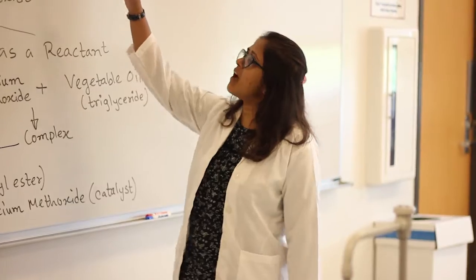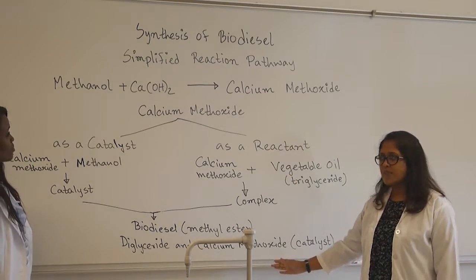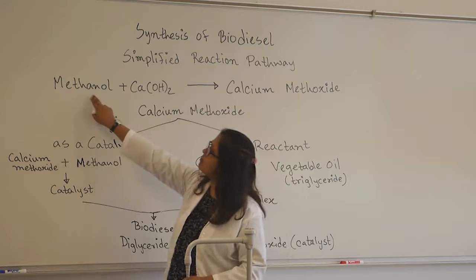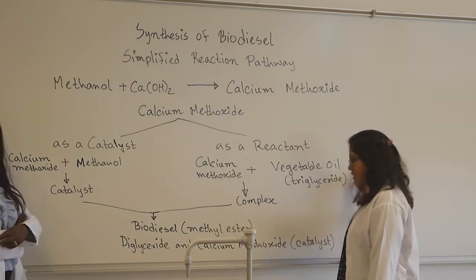This is a simplified reaction pathway from the background of the lab content. Here, the main reactants are methanol, calcium hydroxide, and the vegetable oil.